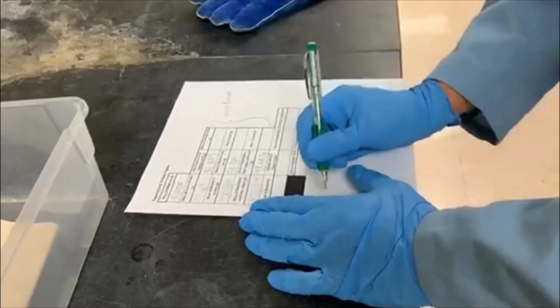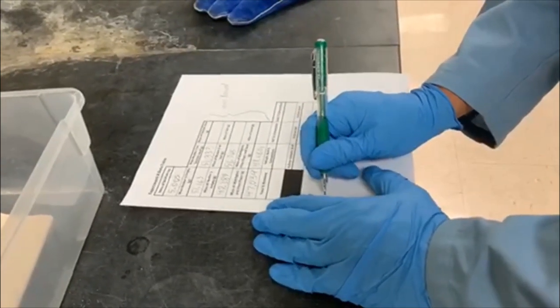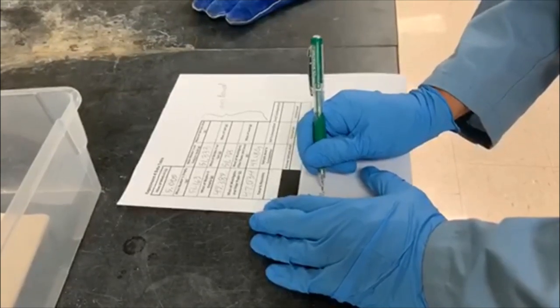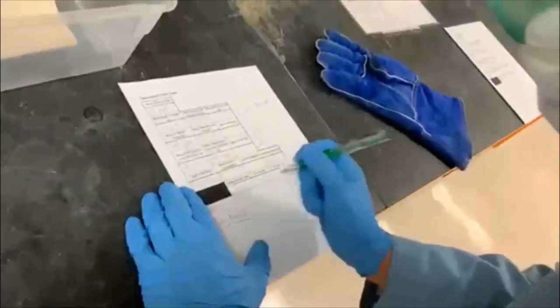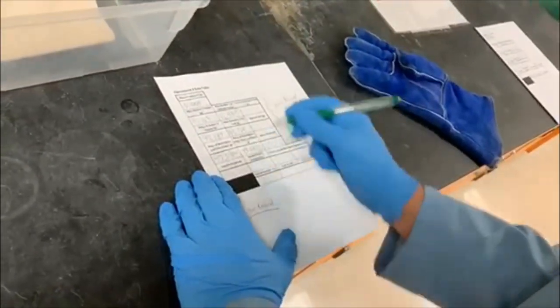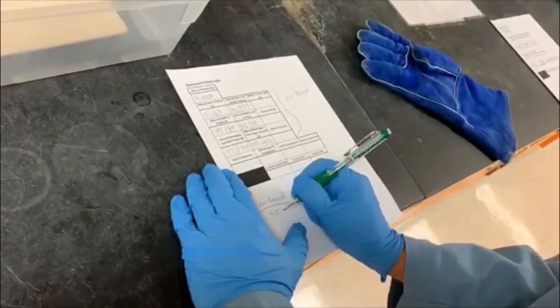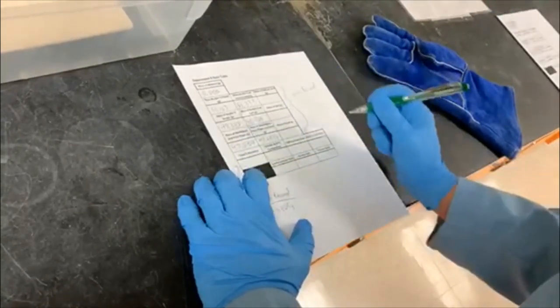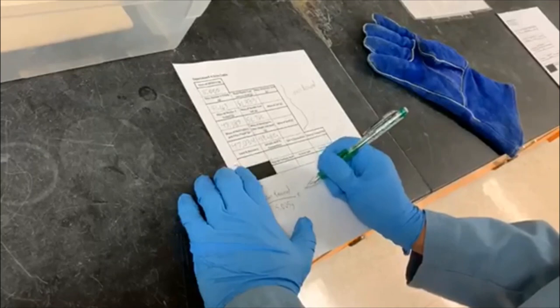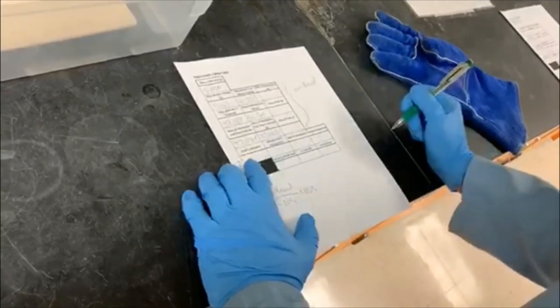And we'd divide our mass recovered by our initial mass, so 5.005 grams, multiplied by 100% to get our total percent recovery.